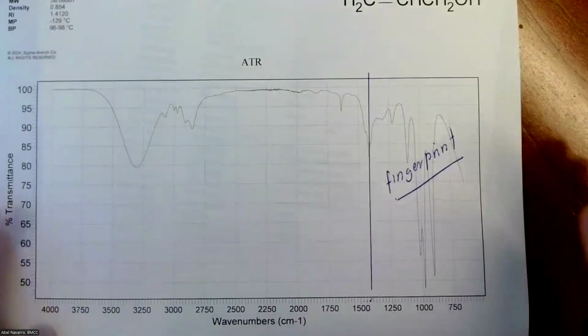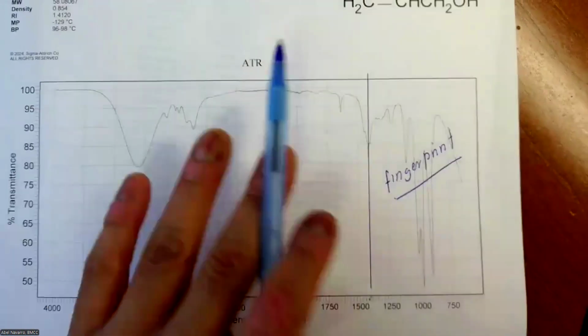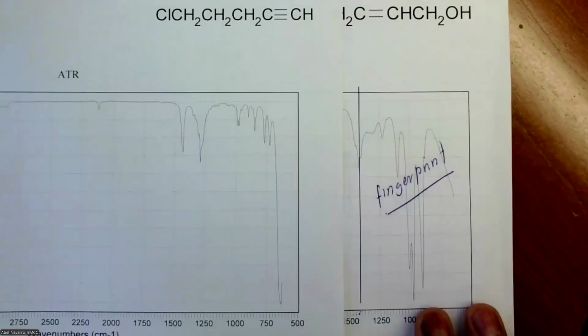All right, so what happened with the fingerprints? Fingerprints are different for every molecule. Look at this molecule. This one is the fingerprint. Now look at this fingerprint. They're totally different.